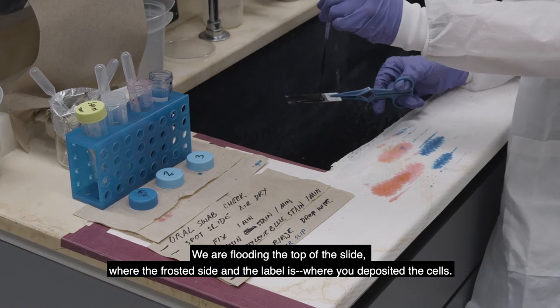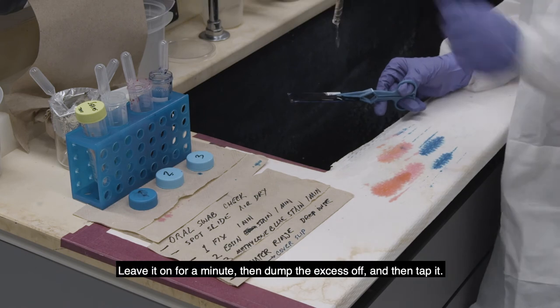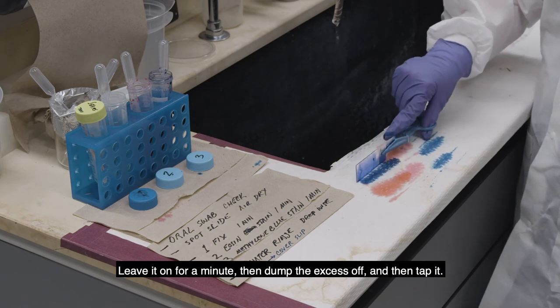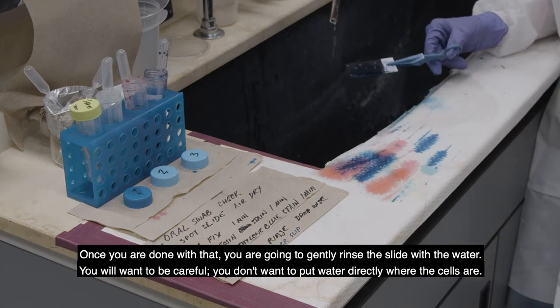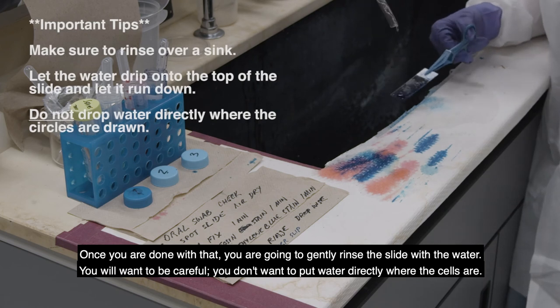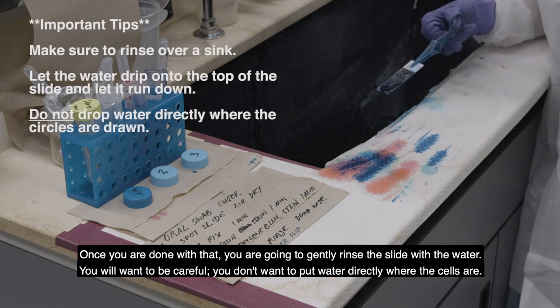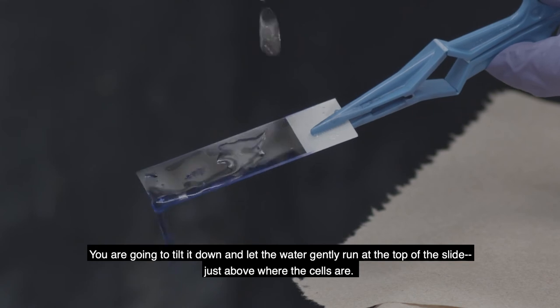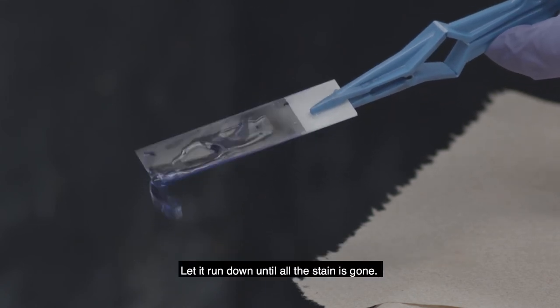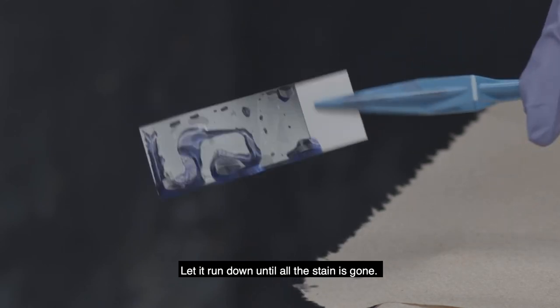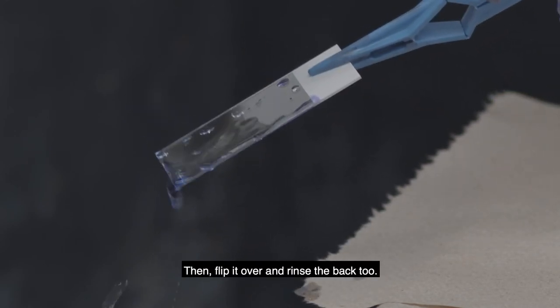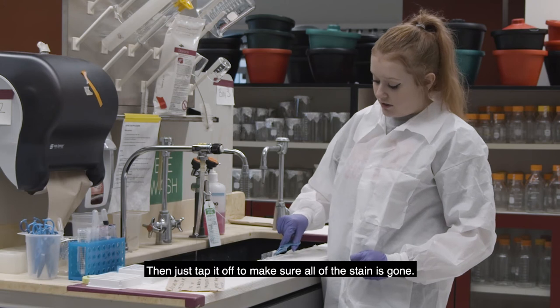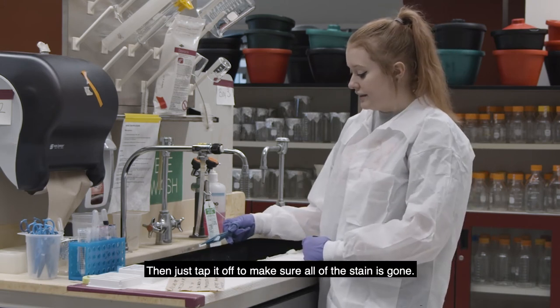And then once you're done with that, you're going to gently rinse with the water. But you want to be careful because you don't want to put the water directly where the cells are. So you're going to kind of tilt it down and let the water gently run at the top of the slide, just above where the cells are. And then let it kind of run down until all the stain is gone. And then flip it over and do the back too. And then just tap it off to make sure that all the stain is gone.